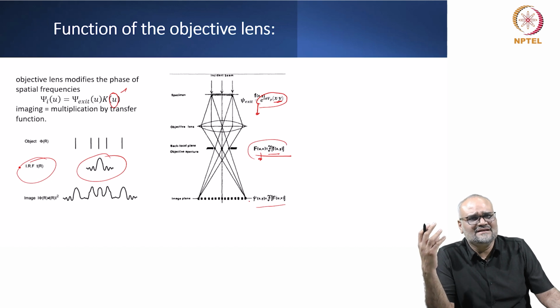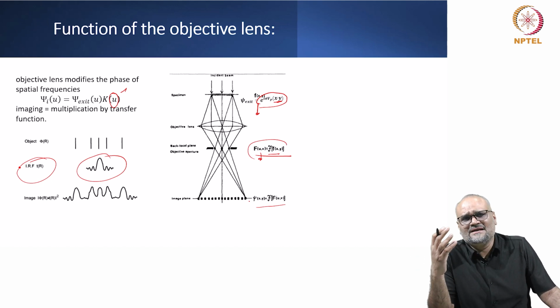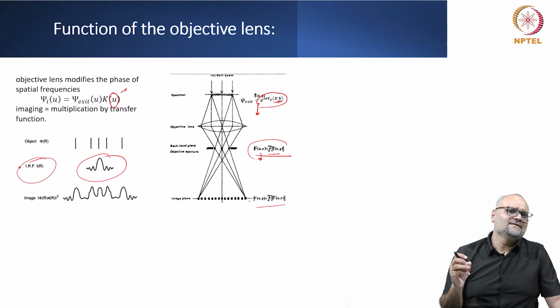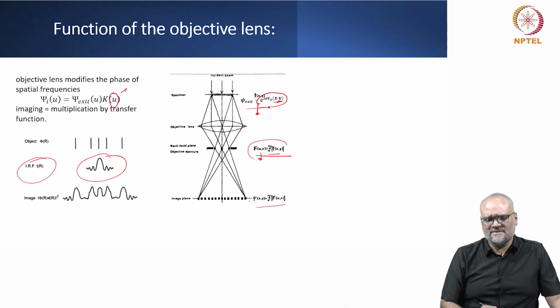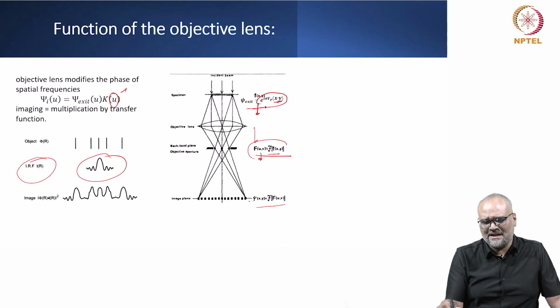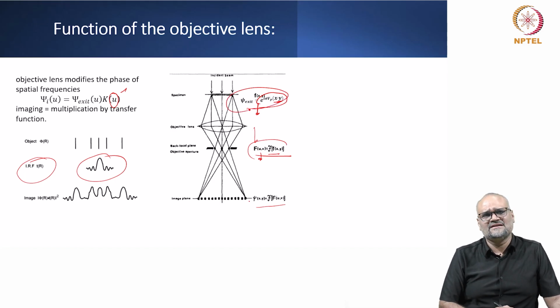You also have the MTF, and you call it a CTF. The point is, all the aberrations and all the factors that can modify the phase of the object wave due to the imaging system can all be multiplied with this information of the projected potential, and when I am multiplying two functions, I represent it with a convolution.